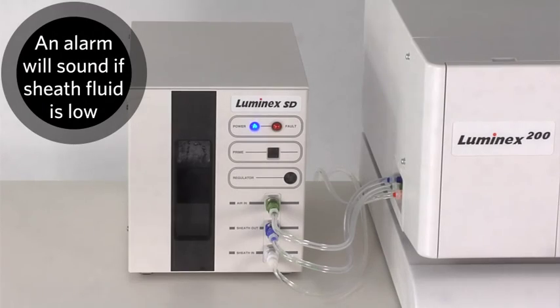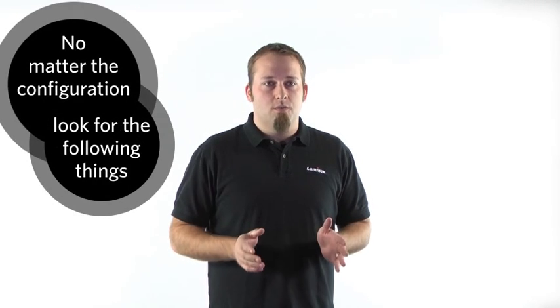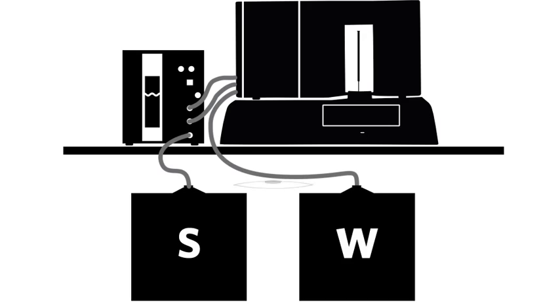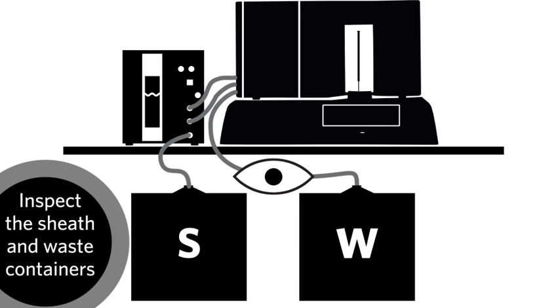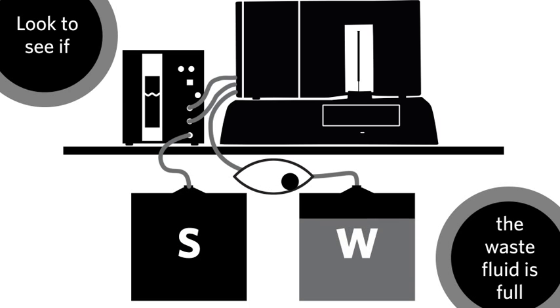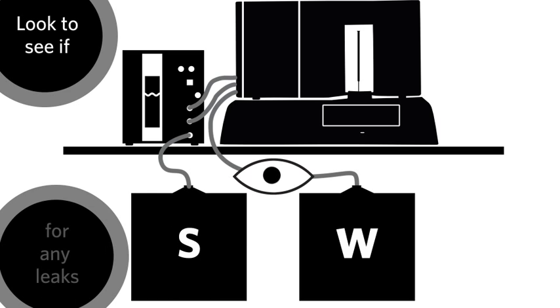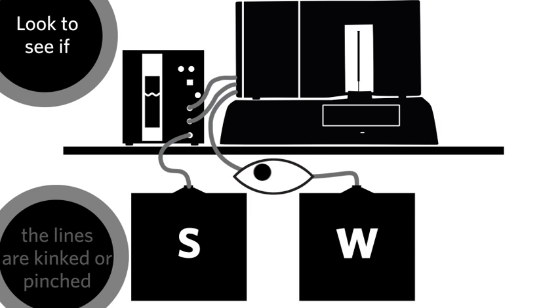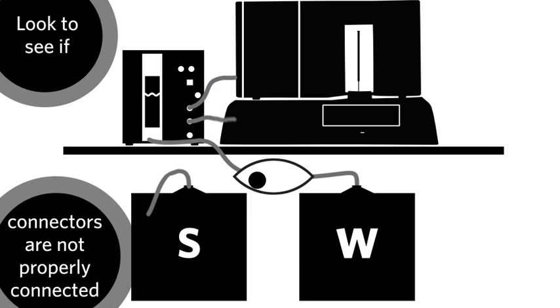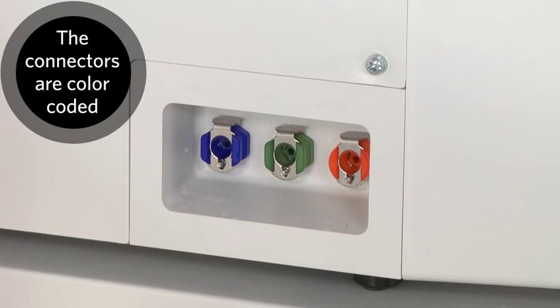If the sheath fluid level becomes low and the reservoir cannot fill to the expected level, it will alert you that the sheath fluid needs to be replaced. No matter which configuration you have, look for the following things. Inspect the sheath fluid and waste containers. Look to see if the sheath fluid is low, the waste fluid is full, the filter is lying on the bottom of the 20L sheath fluid container, there are any leaks, any of the lines have kinks or are pinched, or if any of the connectors to the lines are not connected properly.